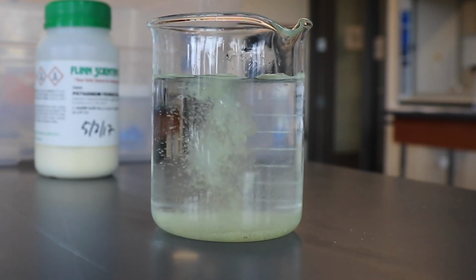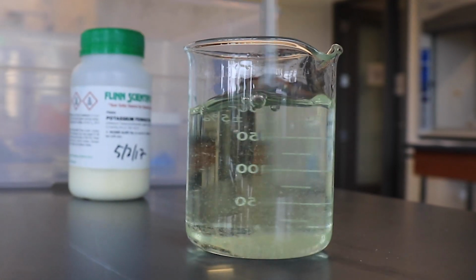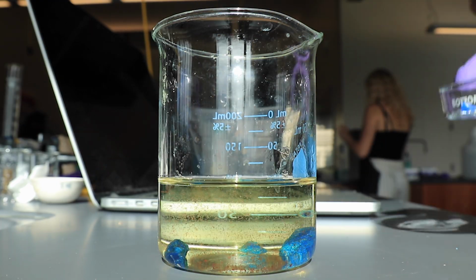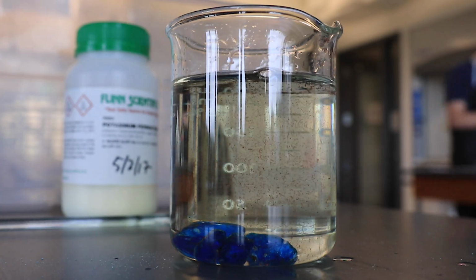For this experiment, we added potassium ferrocyanide into a container of water. Once it was completely dissolved, we added a few crystals of cupric sulfate and the cells began to form.